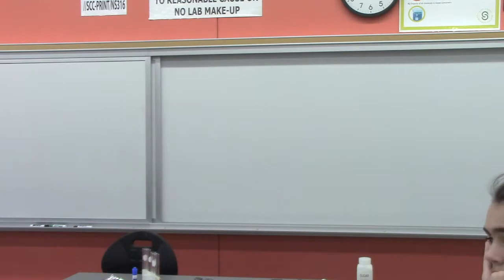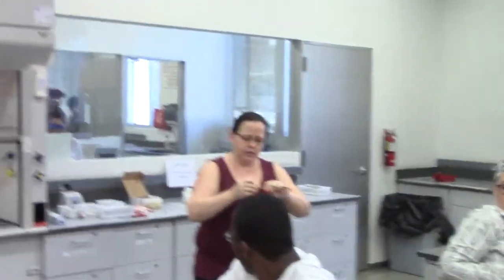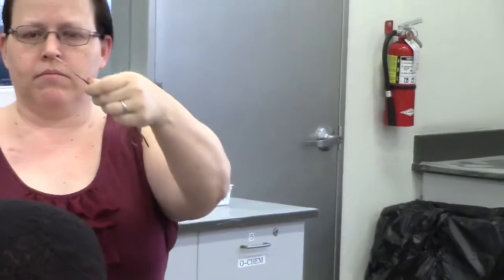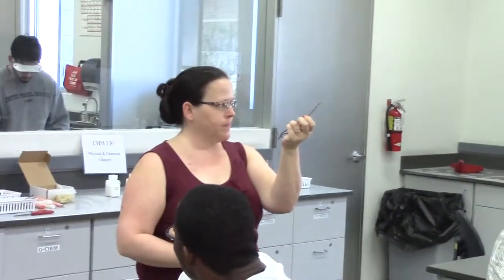If you take just a little bit of sandpaper, wrap it around here, and then just kind of go back and forth, it'll sand off all those little edges. And pretty quickly, I get that shiny new penny color, right? Nice, clean, shiny copper, okay? We're going to heat these up in the Bunsen burners, okay?